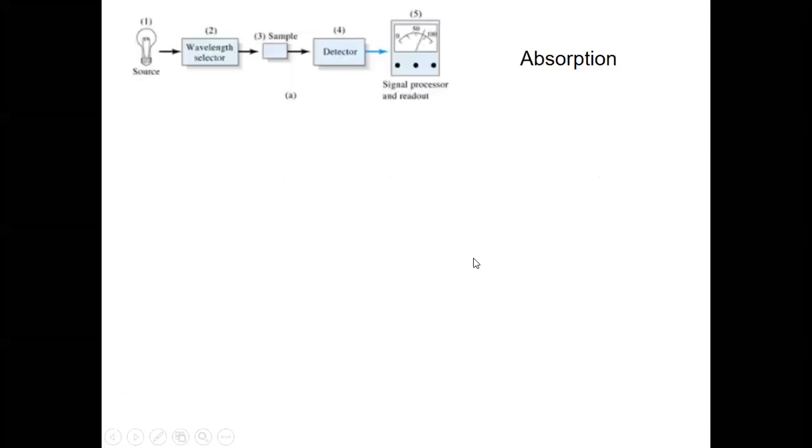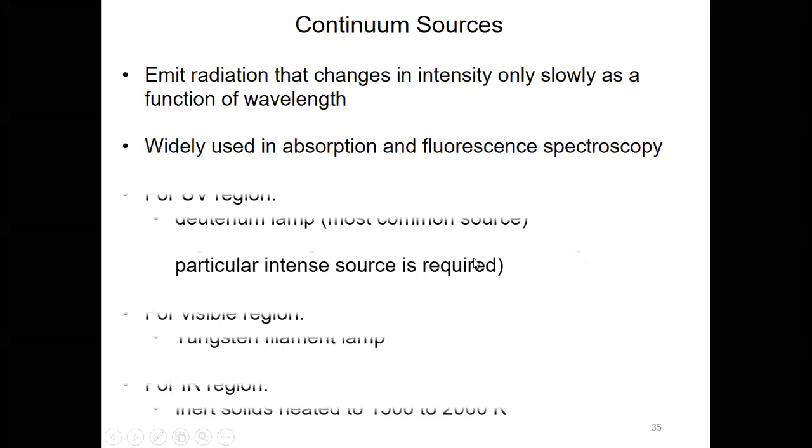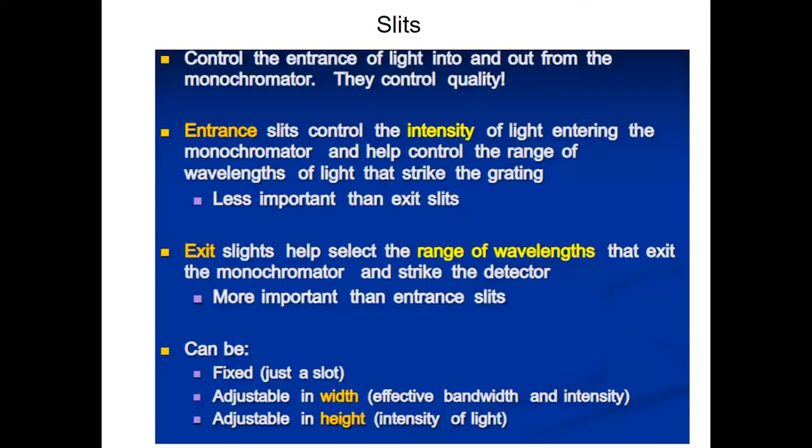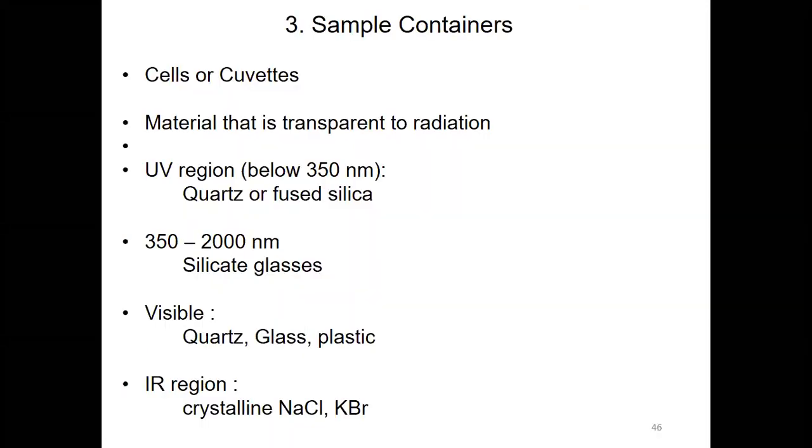So let's discuss other three components today. The third one is the sample containers.